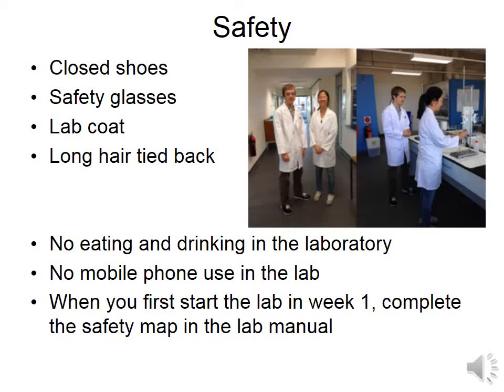As usual, there should be no eating or drinking in the laboratory, and you are not permitted to use your mobile phones while you are in the lab. If you absolutely must take a call, please step outside. The only exception to this rule is that you may use your camera to photograph some results for your report, such as your TLC plates in Experiment 5.